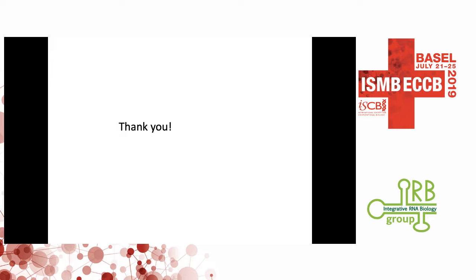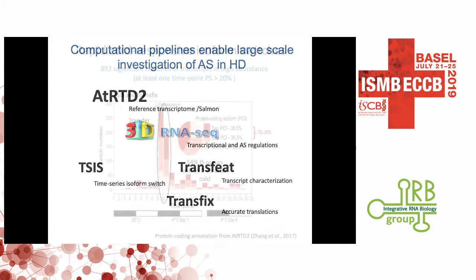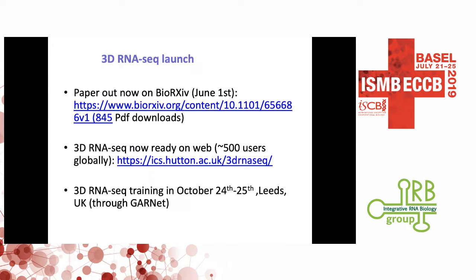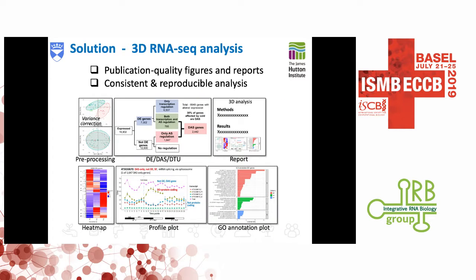Okay. So how do you evaluate your accuracy for all of those various tools? I'm very interested in splicing specifically. You mean the RNA quantification? Yeah, for splicing variations. So we basically generated a high-resolution RT-PCR panel of about 62 genes. They involve hundreds of transcripts, but we also have 3 biological replicates. So that gives us 700 data points on that plot.